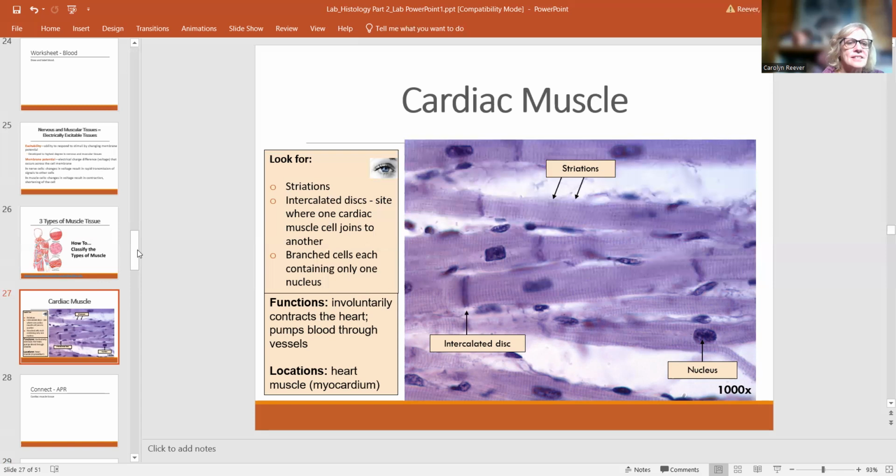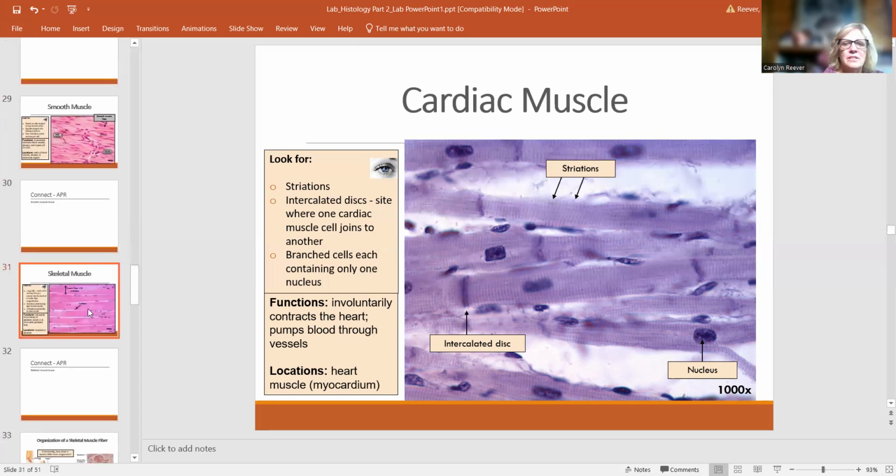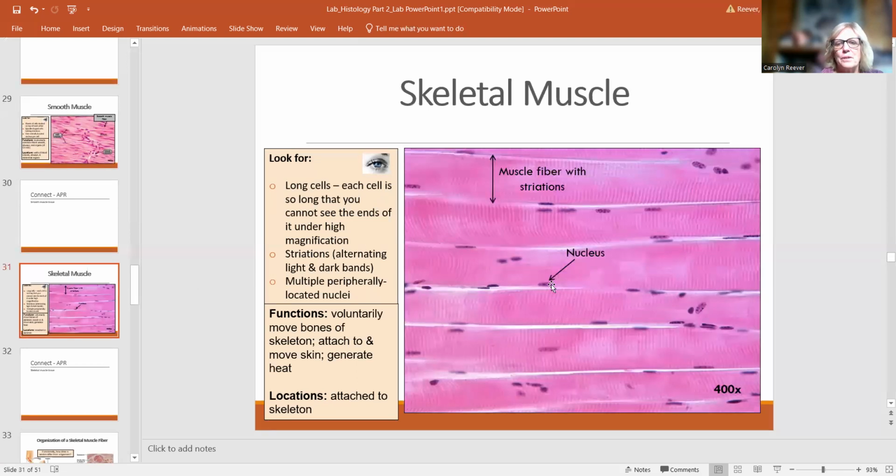Whereas if you look at the skeletal muscle, see how the nuclei are kind of pressed out along the edges, and there's a bunch of them. So that's another giveaway. They're multinucleated. There's also a lot of mitochondria in skeletal muscle. Why would that be?